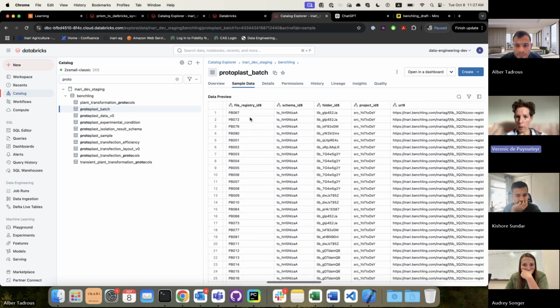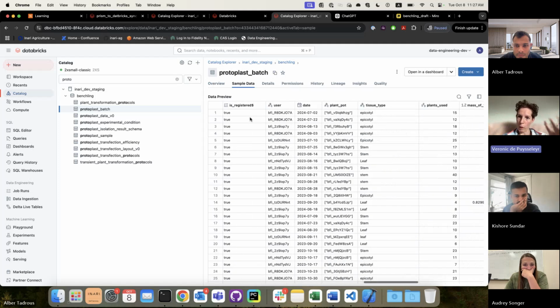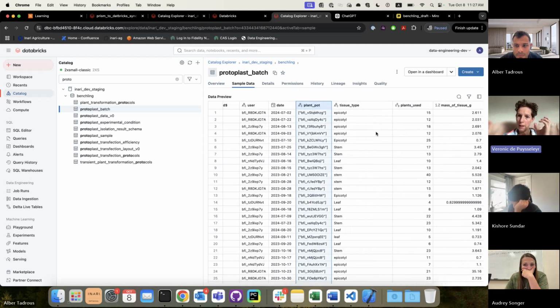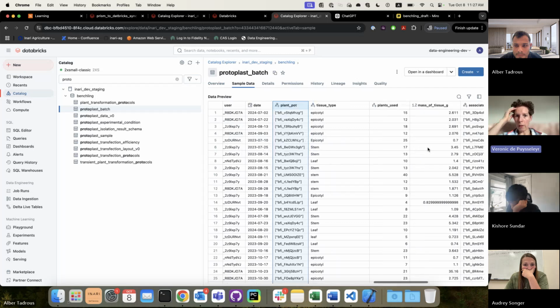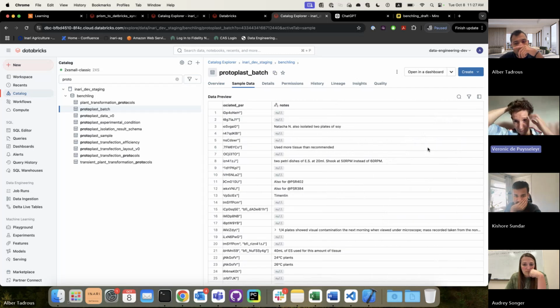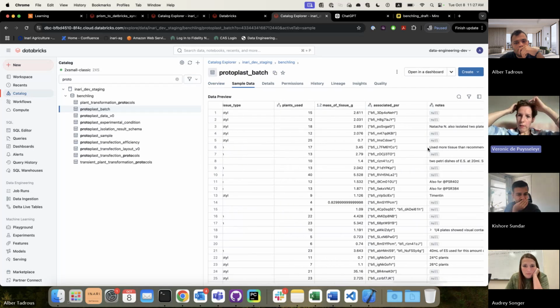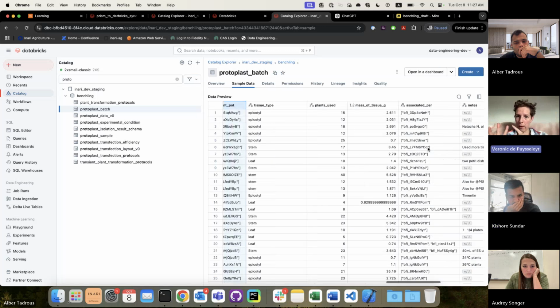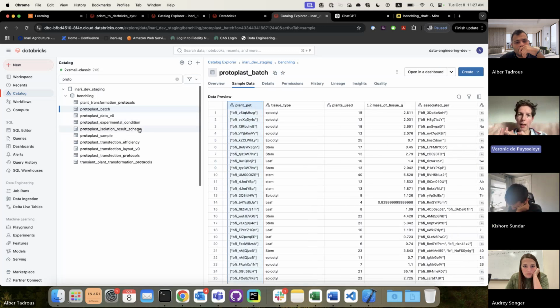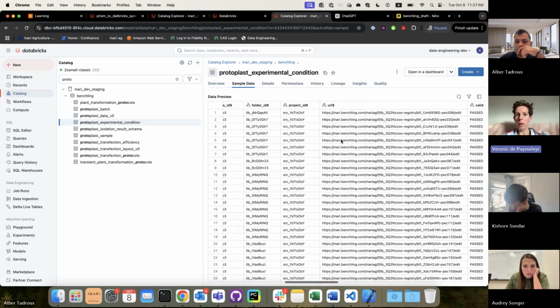So in reality, how this works is you grow plants and then you extract the protoplasts. You sow plants from seed and then you extract protoplasts. So then they create a protoplast batch. So that determines the cultivar in which the results are being generated. And then the other relevant information are three metadata fields: the Cas protein batch, the guide, and the plasmid. Those are also metadata fields on this.